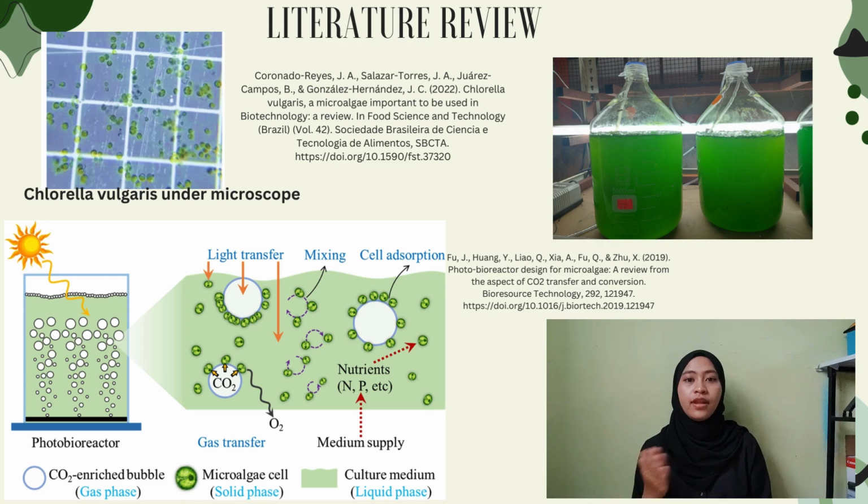Absorbing and transferring of light in the microalgae suspension are the key factors directly affecting the photosynthesis rate. Therefore, an efficient photobioreactor should be able to harvest as much light energy as possible and then transport and distribute it into microalgae cells in suspension so that maximum light energy can be used for biomass accumulation. However, in fact, a typical photobioreactor can be treated as a three-phase system. The culture medium, algae cells, and carbon dioxide bubbles are considered as the liquid, solid, and gas phases respectively.